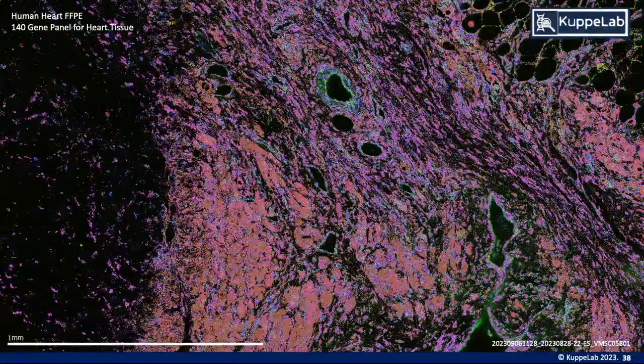These here are the adipocytes, where you, of course, see black holes because this is the fat that has been stored in those cells, and only in the periphery you see basically the transcripts of an individual cell. And this is even possible with FFPE tissue, which I find really exciting. If you zoom in further, you can even see that for some cells, like the fibroblasts, and I'm sorry for this rather low resolution image here, but you can actually appreciate that some of those fibroblast arms you can actually even decipher using this technology.